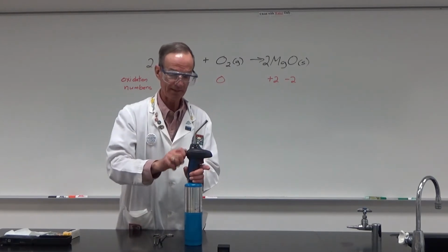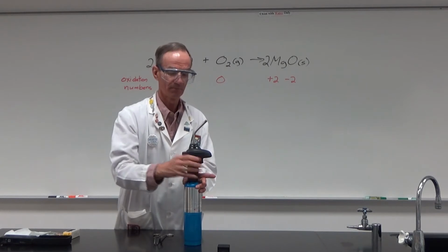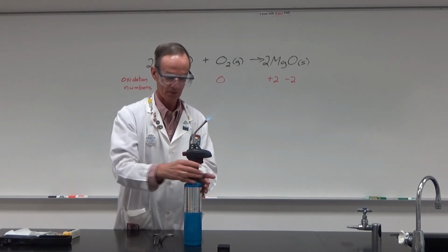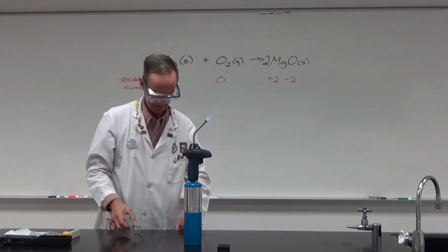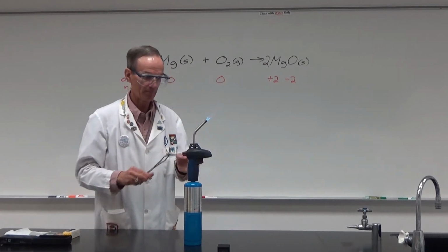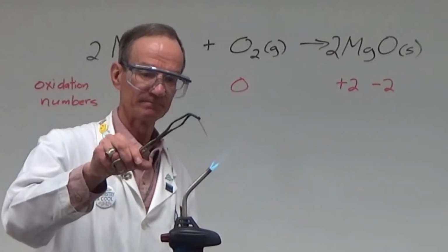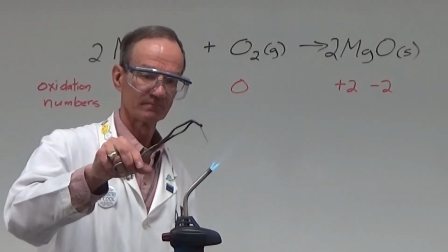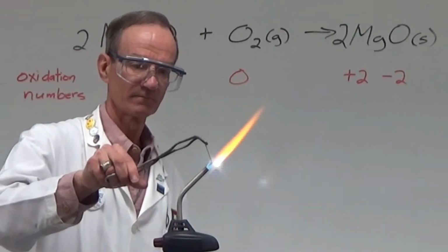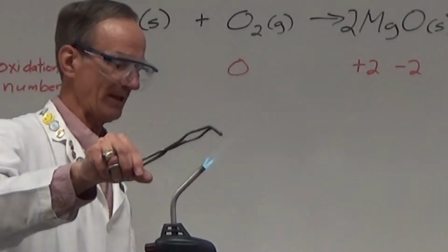This is a really neat reaction. Let me get the flame going here, like so. And I'm going to grab onto the magnesium strip, and we're going to put it into the flame. You see a very brilliant, bright flame coming off of there.